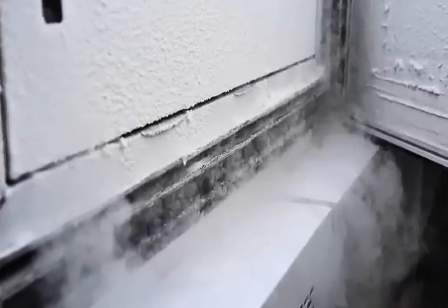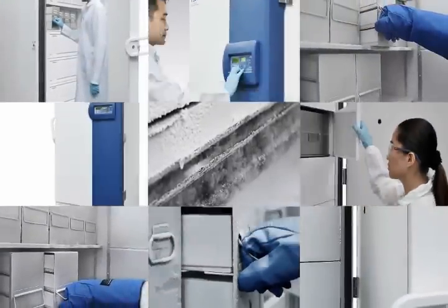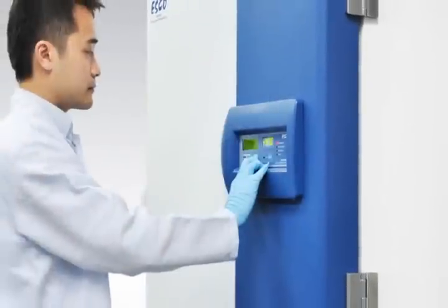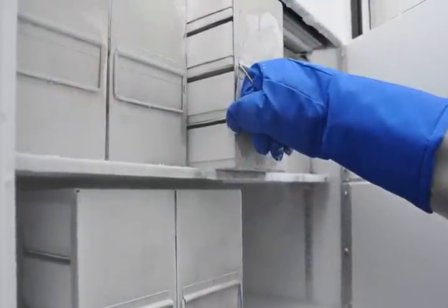Constructed from high-quality proven components with energy-efficient refrigeration design, ESCO Lexicon ULT freezers provide high-quality protection that can withstand the test of time to guarantee the integrity of your samples.